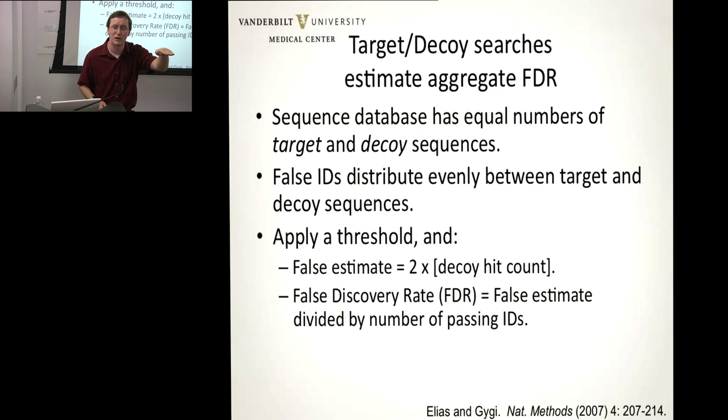So this has been the great leveler of score evaluation, and really I think has been one of the most important effects on the proteomics field in the last 5 years, that people are no longer able to publish identifications that are completely erroneous without having to pass some sort of publishing guideline that says you have to evaluate the error in your IDs.